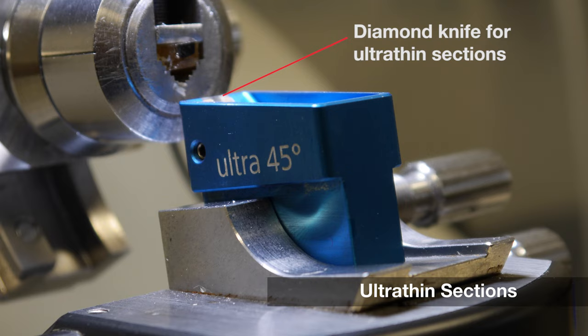The glass knife is replaced with a diamond knife that makes cutting the ultrathin sections easier. The water bath is filled with water and the ultrathin sections float off as they leave the knife edge.